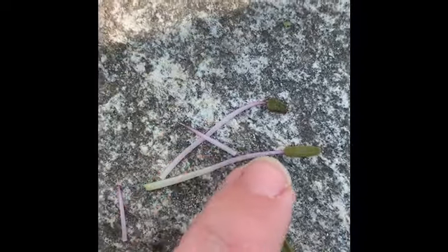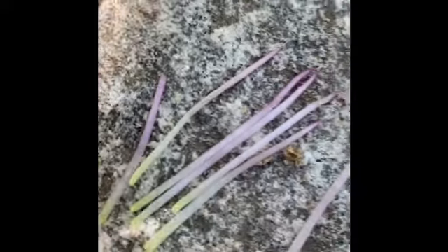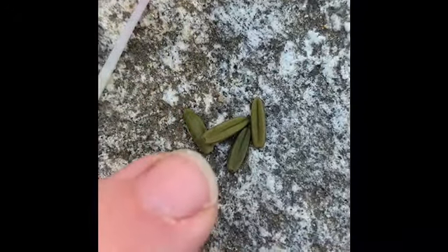Here are petals, the flower petals, the leaves. Right here you have the stamen, the anther connected to the filament. Here you can see some more of the anthers. Here are some filament, a lot more anthers that I peeled off or plucked off from the flower.